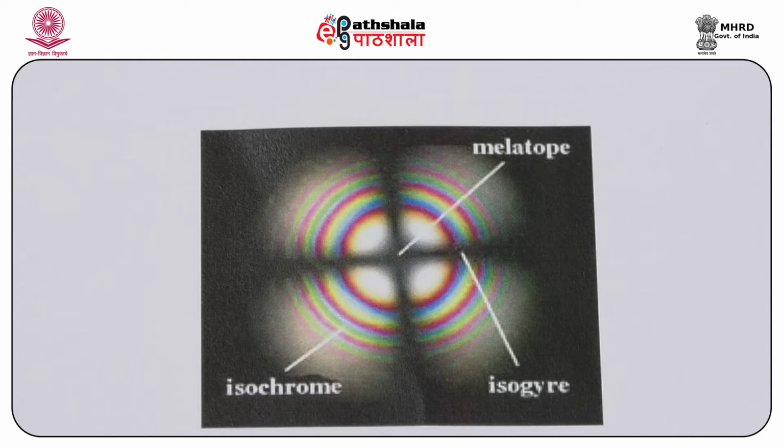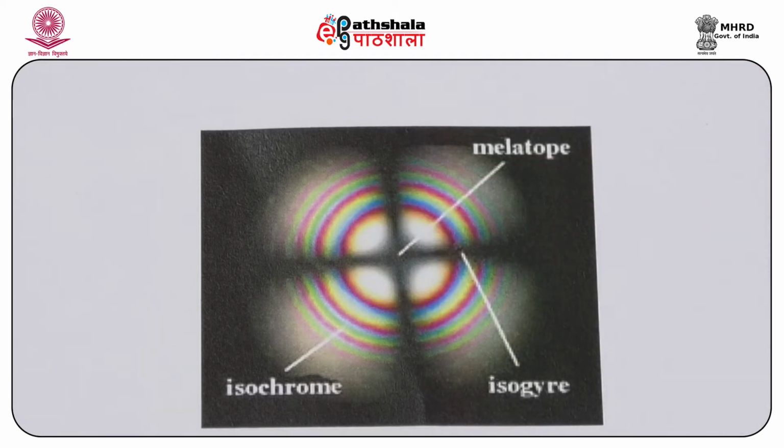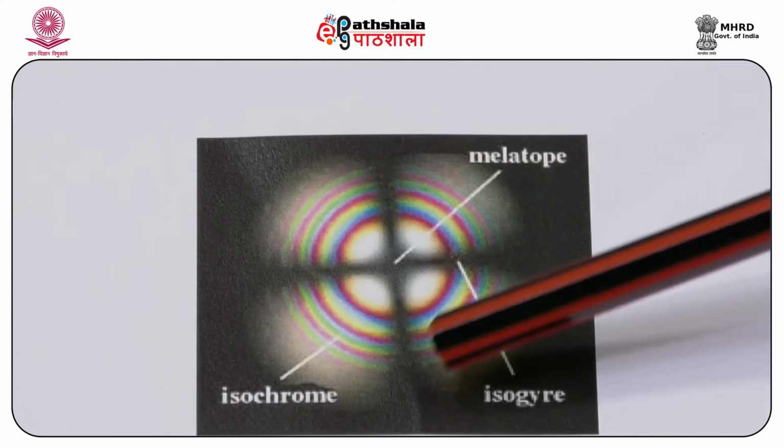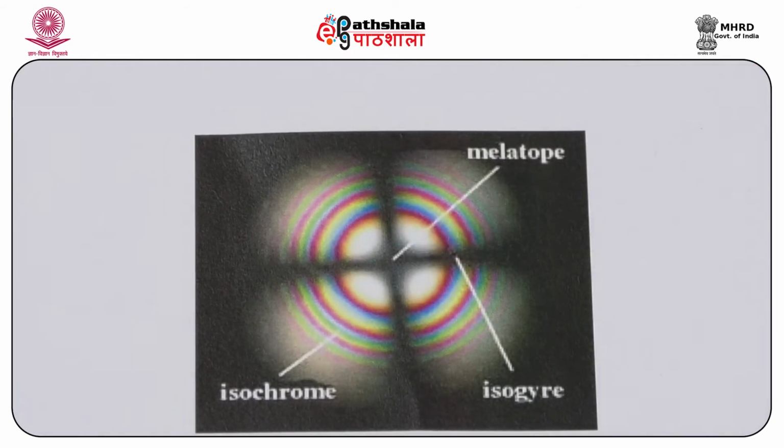A grain with a vertical optic axis should display the lowest interference color of all grains in this sample, and this is how you will choose the grain which you will orient for the optic axis interference figure. The interference figure consists of isogyres forming a dark cross, and superimposed on it are colored rings, as you can see here, which are called the isochromes.